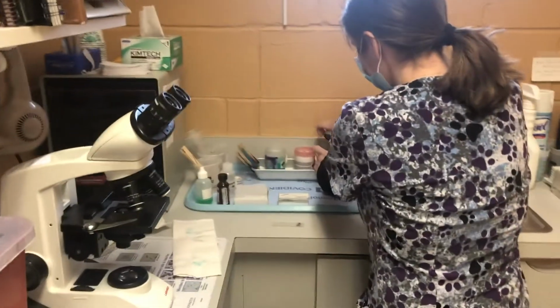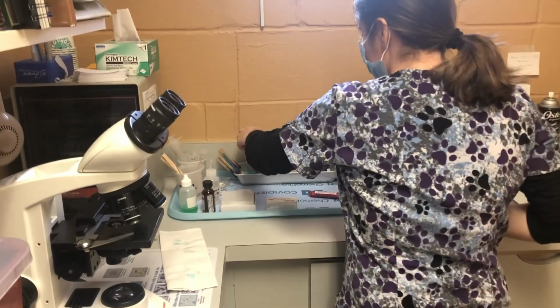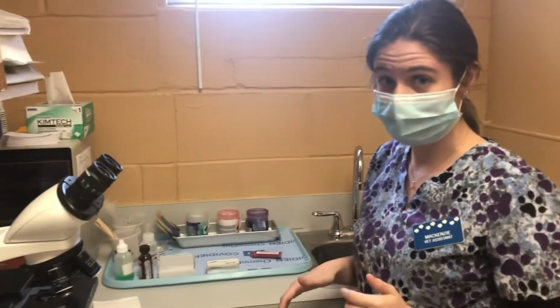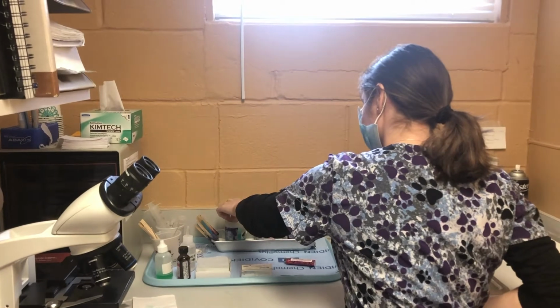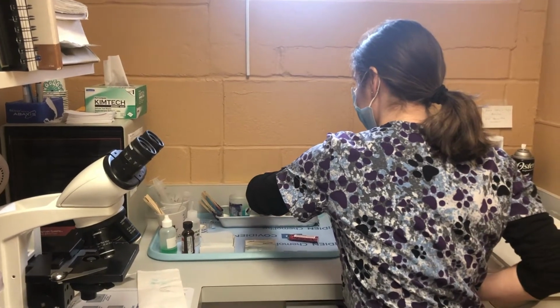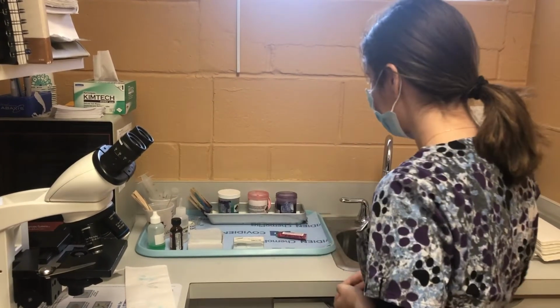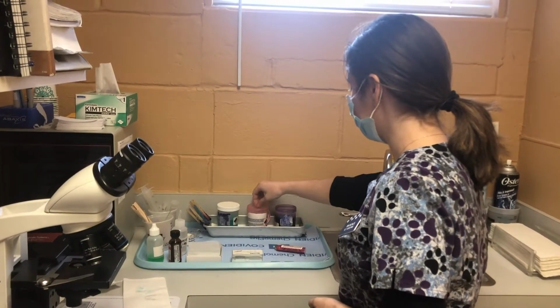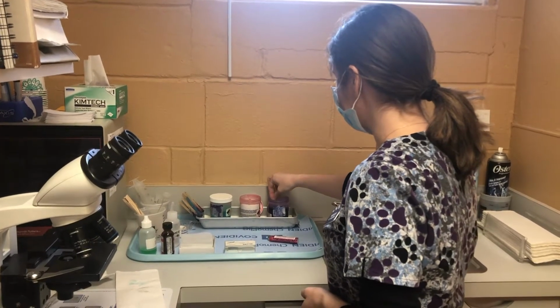It doesn't need to be heat fixed, but we are going to put it in the fixative for 10 seconds. And then we'll move on to our eosin stain. So we'll put it into our eosin stain, cover up our fixative. And then next we'll put it in our methylene blue stain.